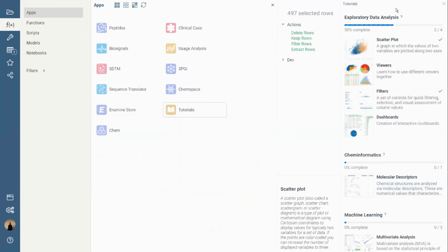So this is mainly it. Some tutorials are that simple, like the one that we have finished, and others include more complex logic, for instance, switching between different views or invoking a set of functions in the specified order. And the main purpose for all of this is to really show users how to easily accomplish the tasks that are important to them and how to navigate the platform and just do it fairly quickly.